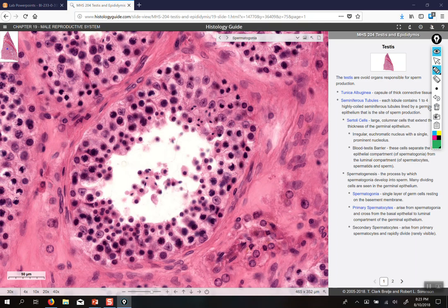Let's next look for primary spermatocytes. Remember, these are going to have dark, round nuclei, but not be by the edge. So here's one, and you're seeing a hodgepodge here because the tissue is semi-transparent, so you can see places where you can actually look through a couple different layers. So here's one. Those are primary spermatocytes. Secondary spermatocytes you don't often see because they divide super rapidly. That's why they're not linked. But you can see a couple here.